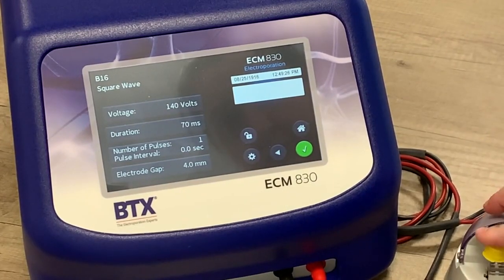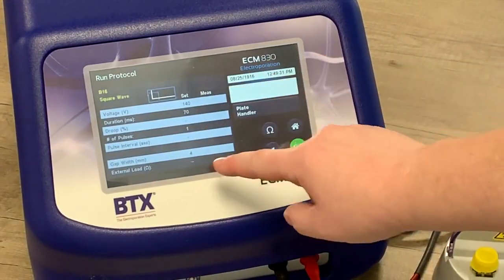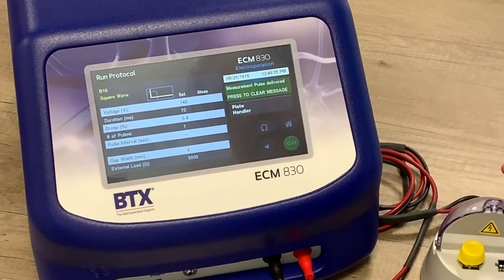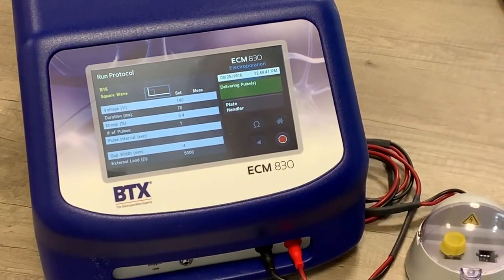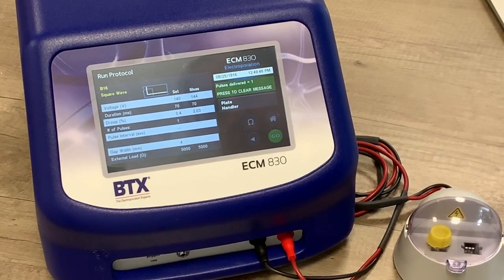BTX electroporators come with a range of different cell accessories, but in this case we are using the most simple, which is the electroporation cuvette. After putting the cuvette in the holder, you need to press the on button, which does a quick pre-electroporation check, and assuming everything is okay, you press the big green button in the corner and the electroporation will take place.